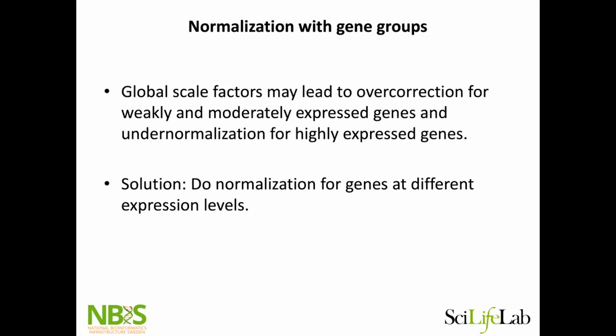Another way of doing normalization is to group the genes, because of global scale factors. I'm sorry.